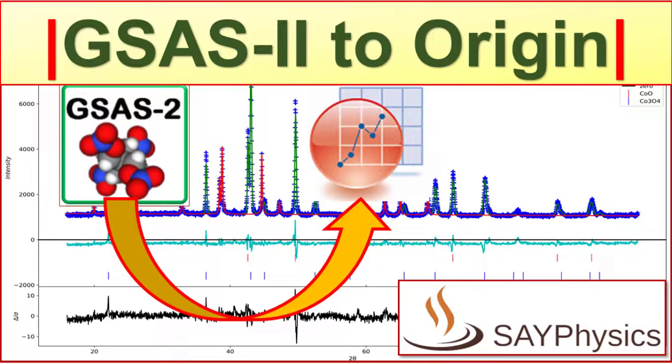In this video we will discuss how to export data from a finalized GSAS-2 project and plot it in Origin Pro.